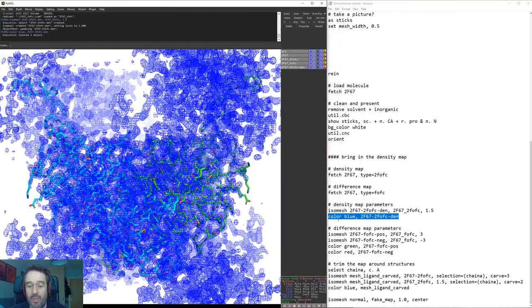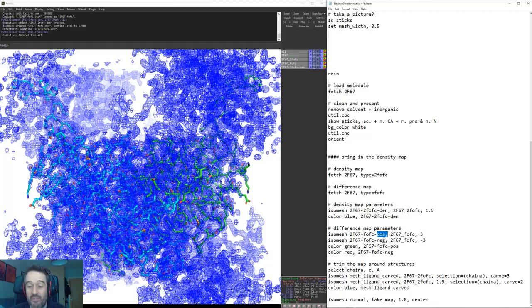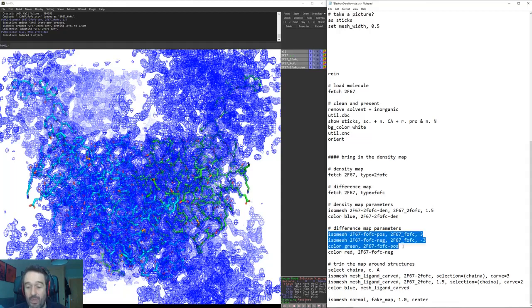Now we're going to do the exact same thing with the difference map except the only difference here is that we're going to make a positive map and we're going to make a negative map, and we're going to make them positive and negative respectively. Then the positive map we'll make green and the negative map we'll make red.